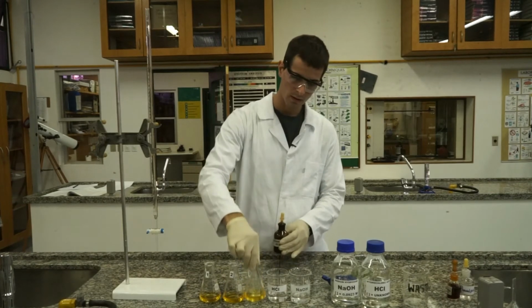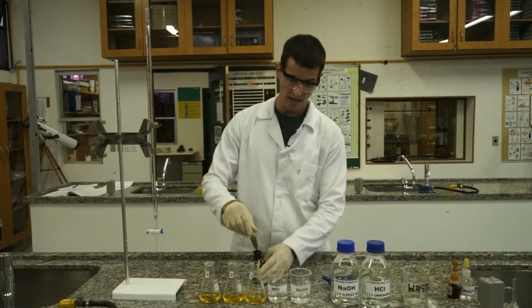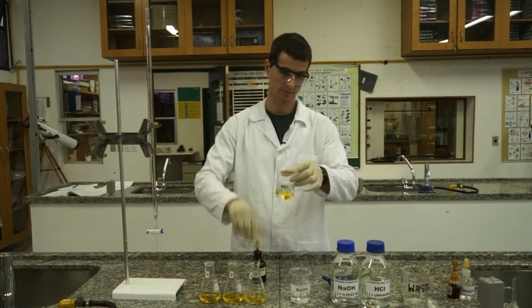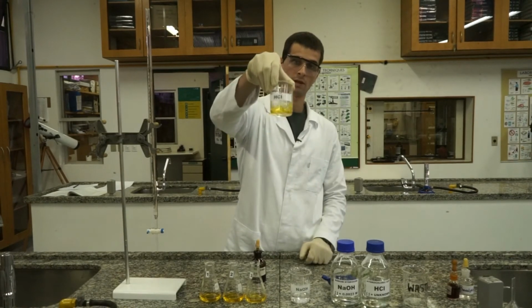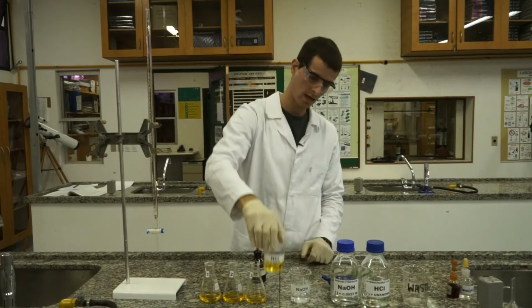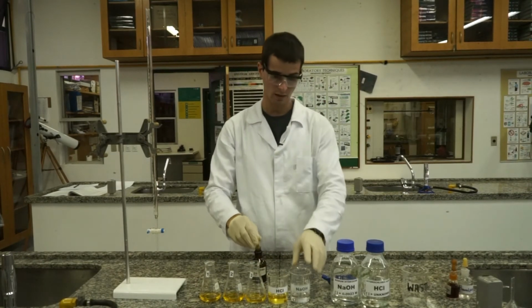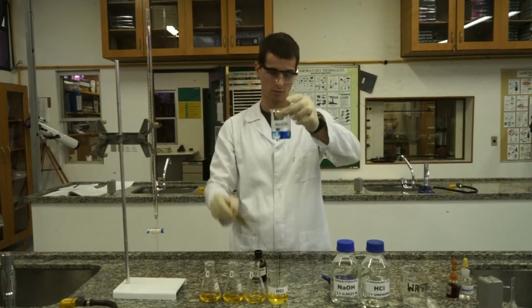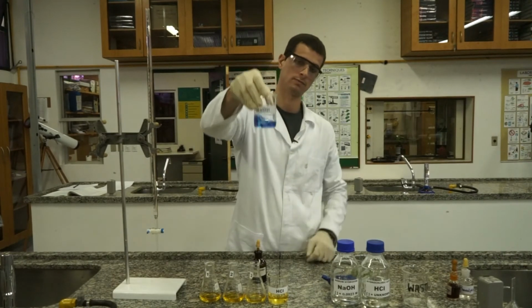Bromothymol Blue is yellow in an acid solution. Look. And in a basic solution, Bromothymol Blue is blue. Look.